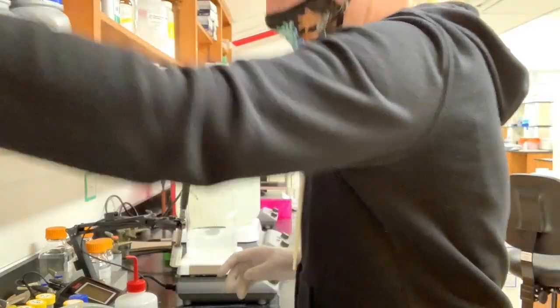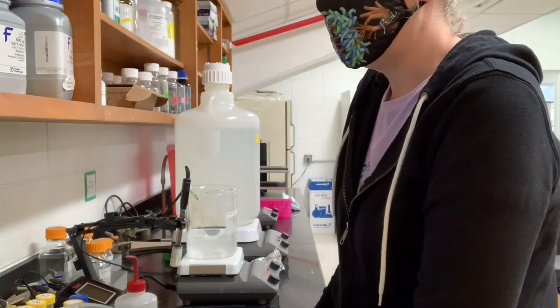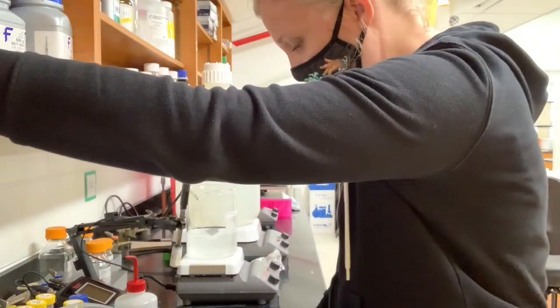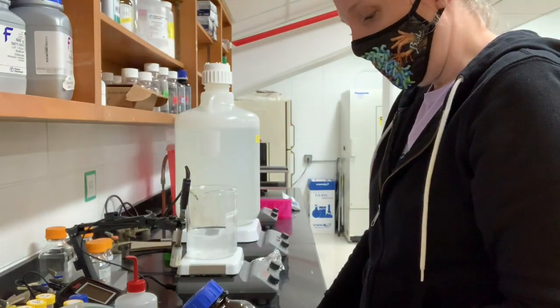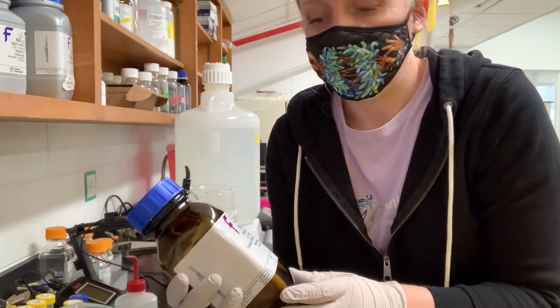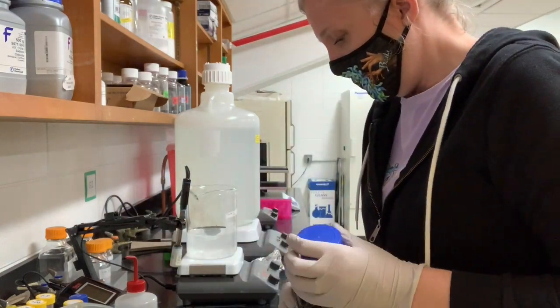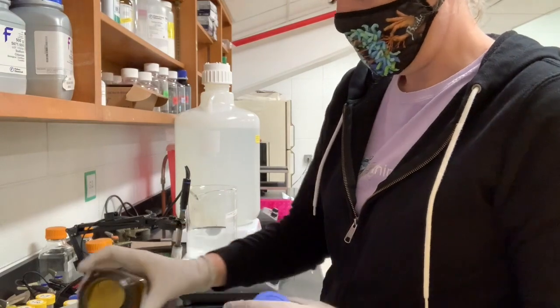So the last component of the solution is KH2PO4, so potassium phosphate. And again, I'm going to make sure that I match up my chemical formula with what's on the bottle. So I need potassium phosphate monobasic, and I need just 2.72 grams.